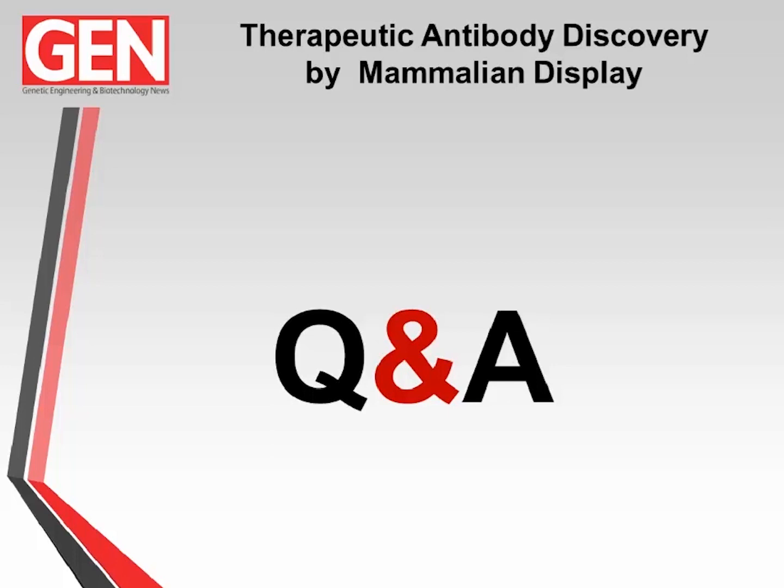In fact, I think on one of the earlier slides we showed that. So no, when I'm talking about 95 to 99% that don't, I mean that basically 1 to 5% of the cells will actually integrate the antibody and give rise to a drug-resistant clone. So by the time we've done drug selection over 2 or 3 weeks, we find that the vast majority of cells are now all expressing an antibody. Have I answered that? Yeah, that's it.